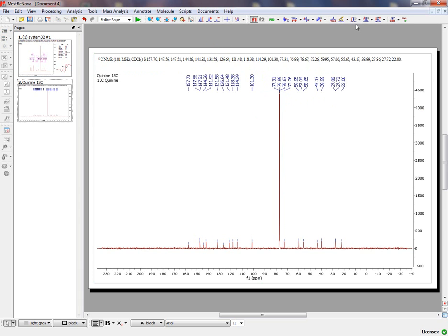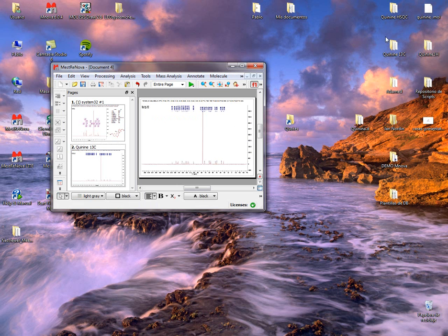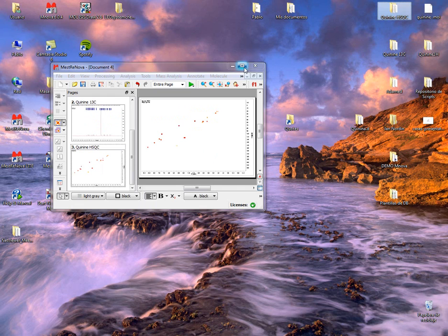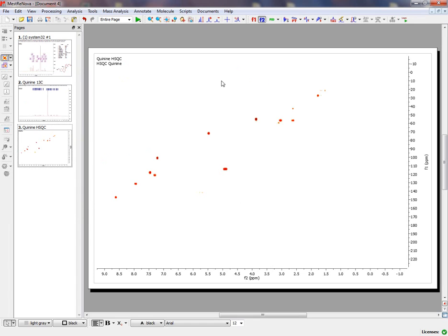Now we are going to show the HSQC. Just by clicking and dragging the Spectrum folder, you will get the HSQC fully processed.